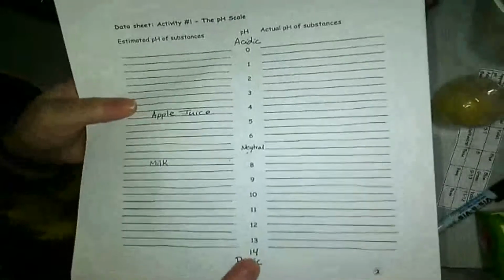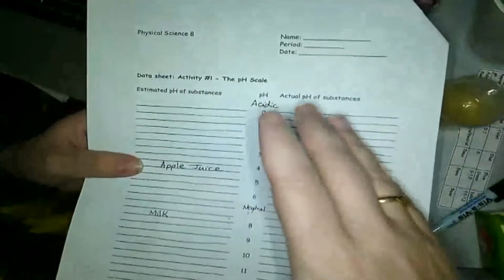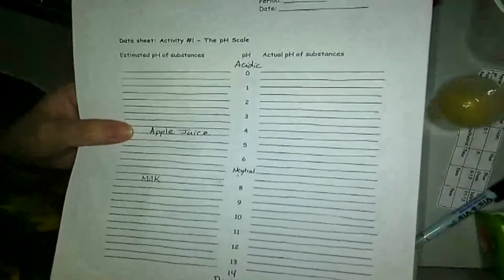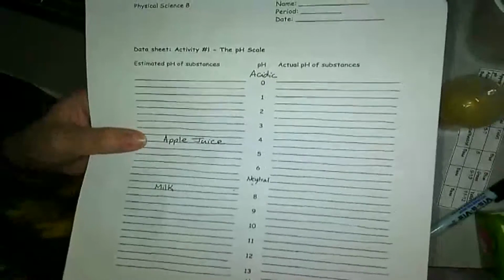As a reminder, your pH scale goes from 0 to 14. I added a 14 to mine. Really strong bases and really strong acids can really hurt you. We are not going to be working with any of those really super strong acids or bases. Sulfuric acid would be like 0, very dangerous. I can't even think of a base that is 14, but even our oven cleaners, things like that, are pretty strong bases.